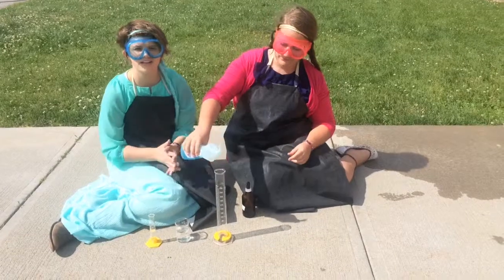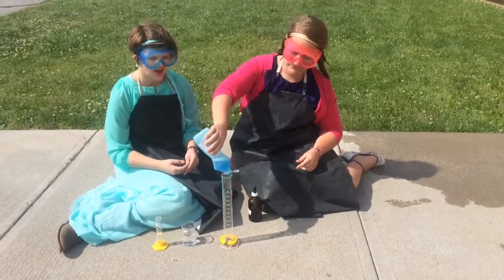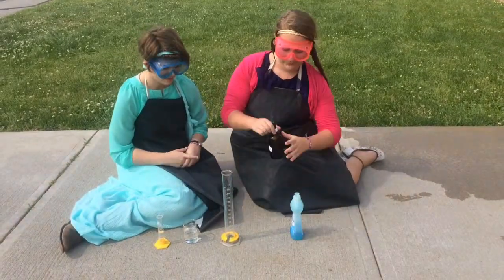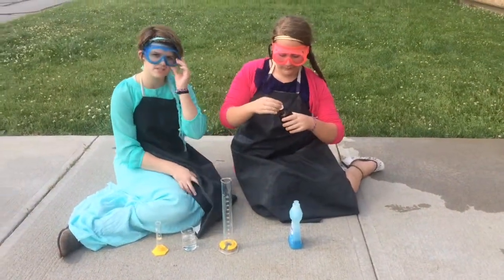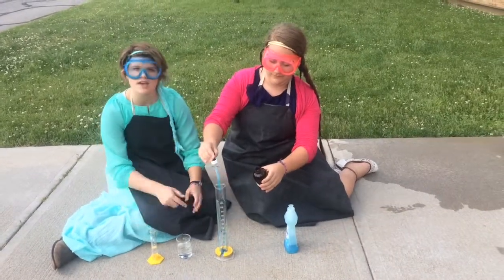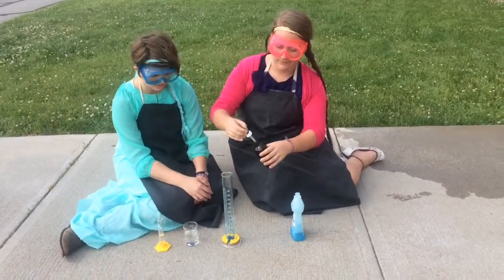Alright, so as you saw in the last two experiments, we were testing to see if potassium iodide and yeast would react the same way when mixed with hydrogen peroxide, and as you can see, the myth has been proven. Yeast reacted the same way, if not better, with the hydrogen peroxide.